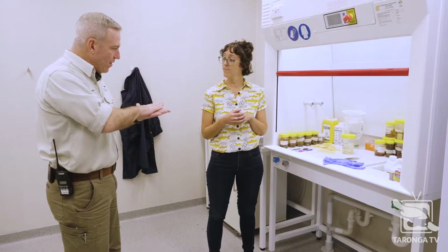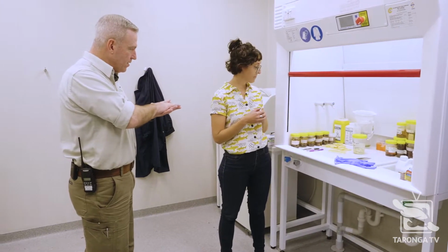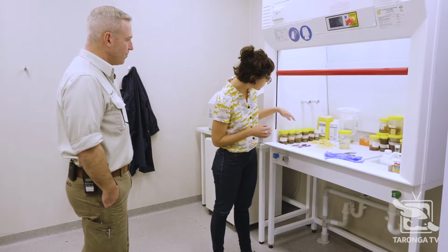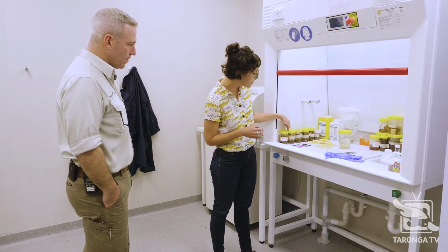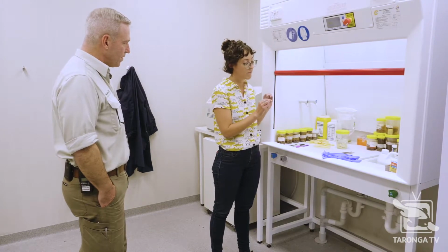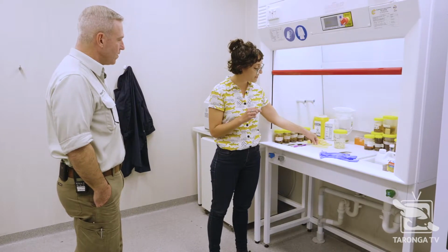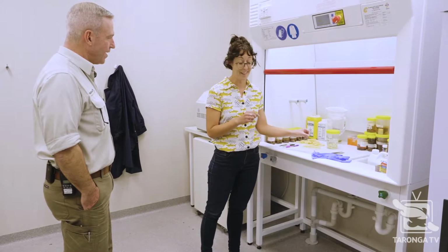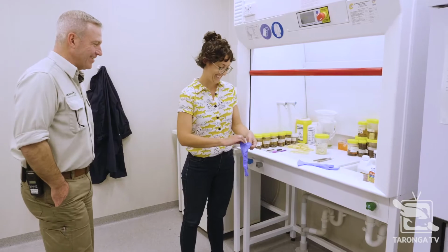And when you prepare it, what do you have to do to get it onto a slide, the finished product? Yeah, so I can actually show you. What we actually do is pour out the tissues, and then I'm literally going through organ by organ and cutting them into small enough tissues to fit onto this cassette here. Yeah. So, happy to oblige. Go on, give us a look.